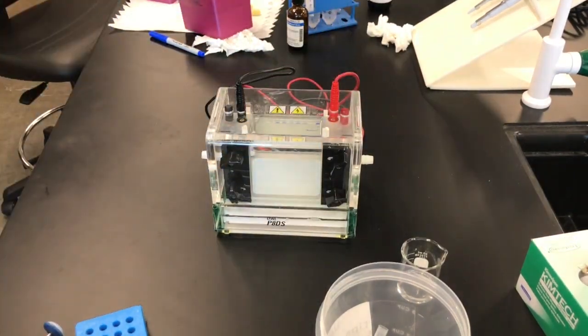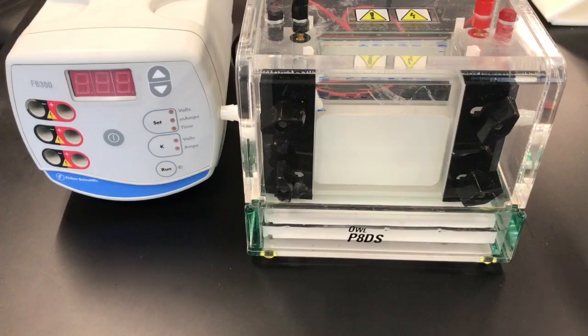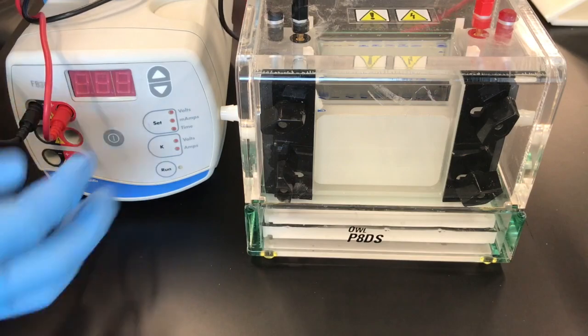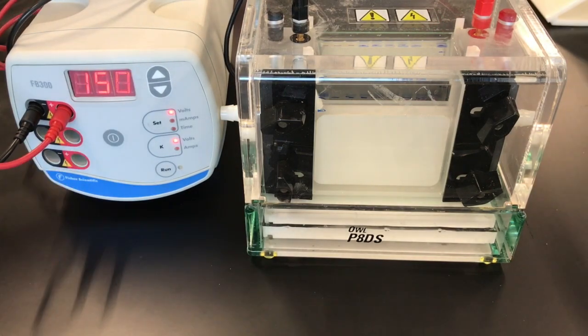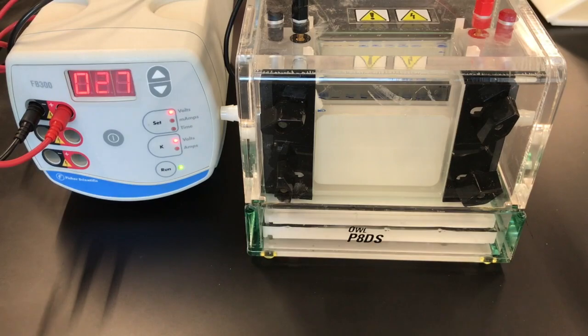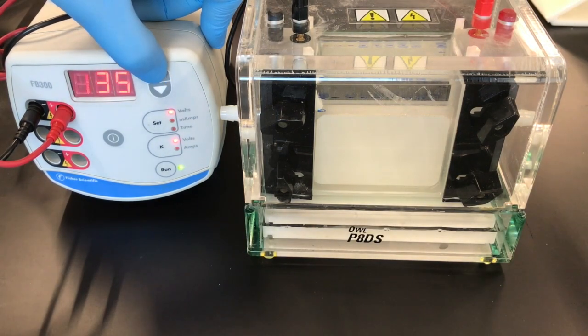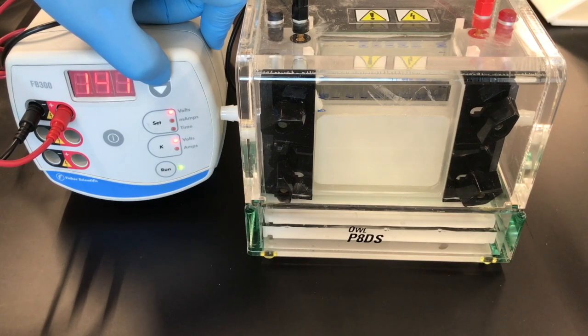You can then also connect the other ends of the wire to the power supply. Again, red to red, black to black. Turn on the power supply. There's a switch in the back and the power button on the front. You can go ahead and set it to 150 volts and then click on run.